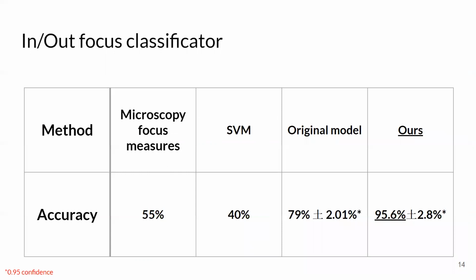Next slide, please. The results of our experiments on this slide were tested on data that was not used during the training. And our test dataset is balanced, of course. That's why we can use an accuracy metric. Next part, please.